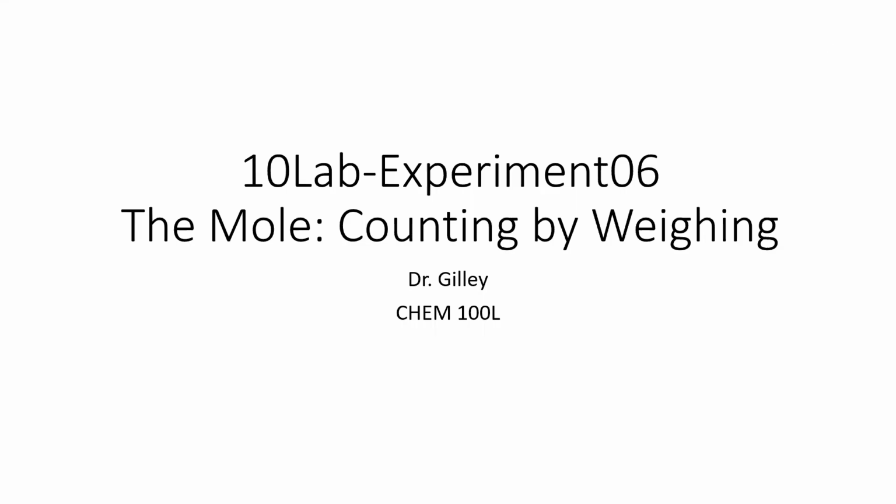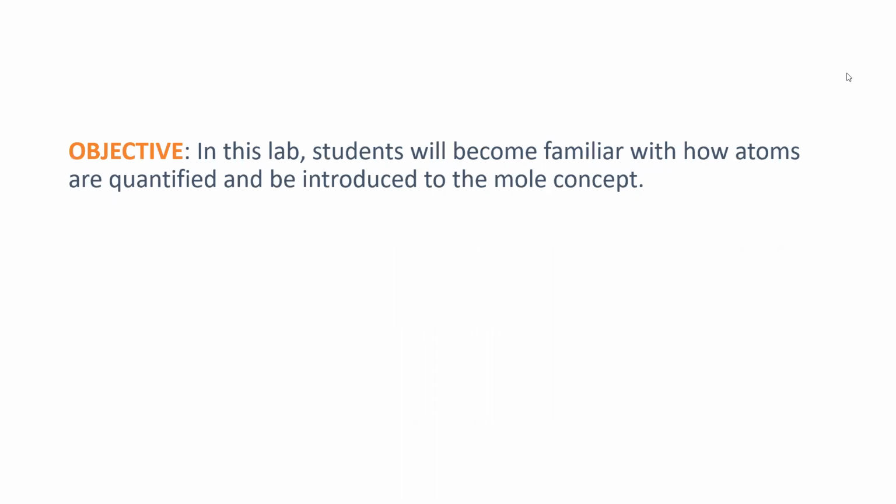Hello and welcome to the pre-lab lecture video for Lab 10, Experiment 6, which is titled The Mole, Counting by Weighing. So the objective of this experiment is for students to become familiar with how atoms are quantified and to be introduced to the concept of the mole.